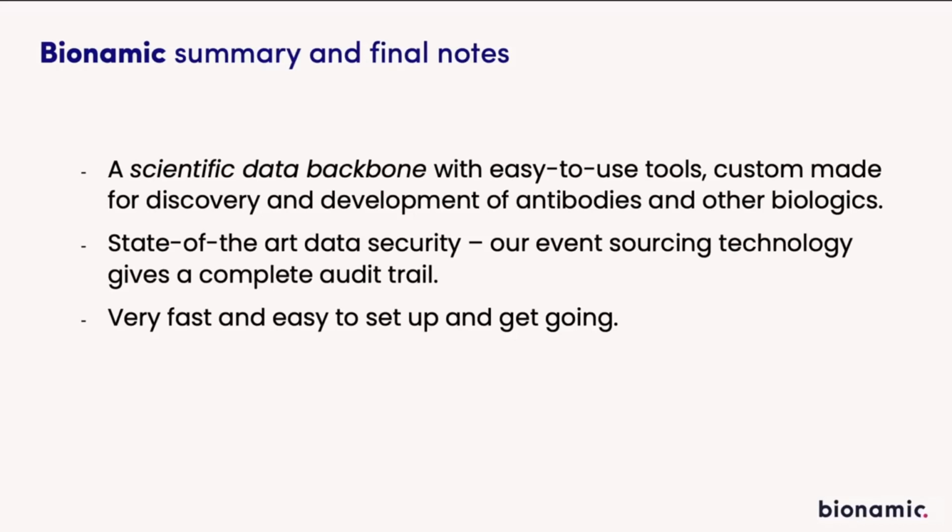There's a lot in common if you use other types of scaffolds. We have state-of-the-art security, going on the cloud. And we use something called event sourcing technology that gives you a complete audit trail of the data. So nothing is ever overwritten, it's just added upon, and we build this great data state from that. It's a lot like what banks do to track all the transactions.